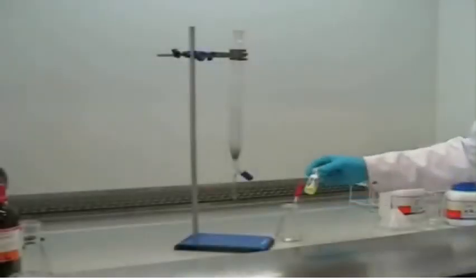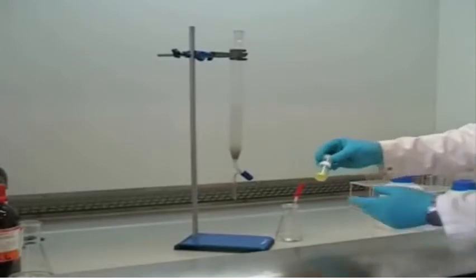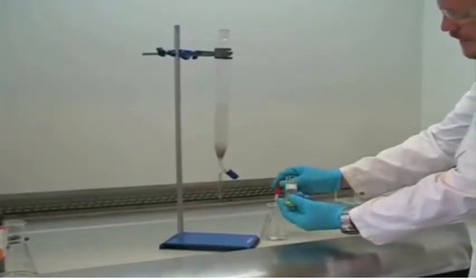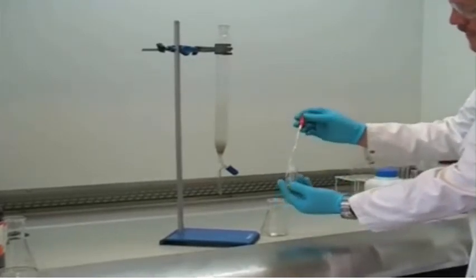Here you can see we've run the eluent down to the correct level so that the top of the silica has not dried out. The next stage is to load our crude compound onto the column. First of all, we need to dissolve it in a small amount of the eluent.